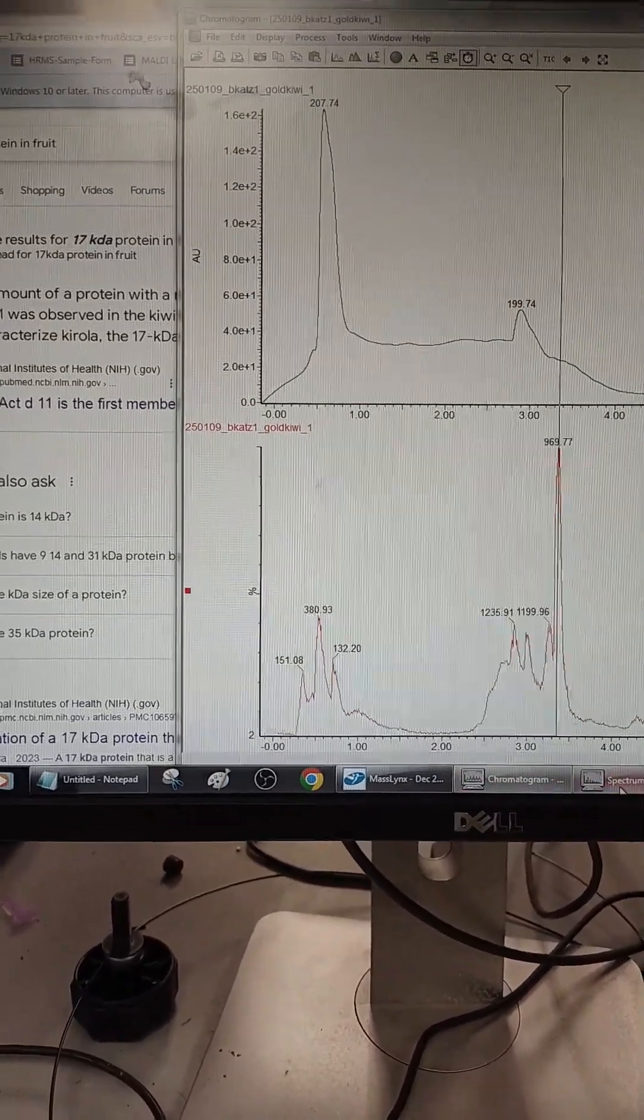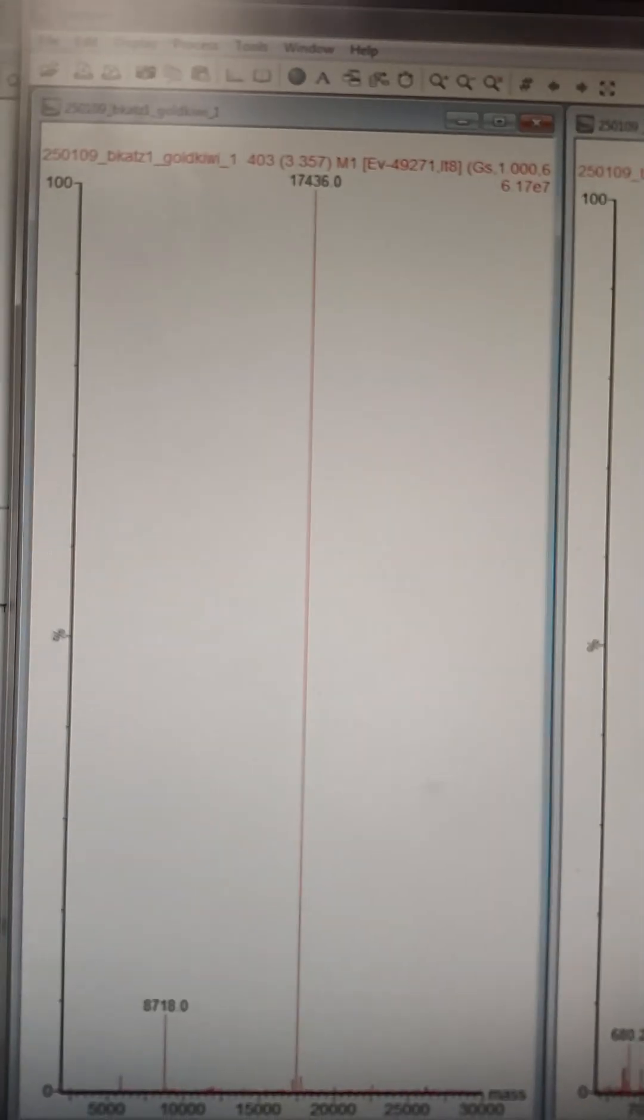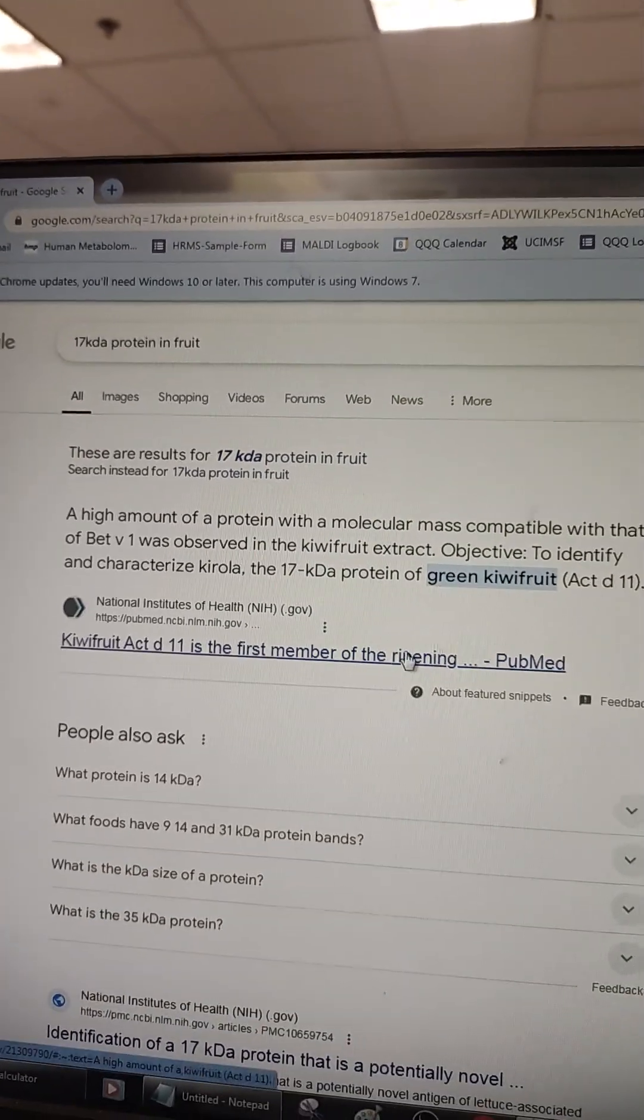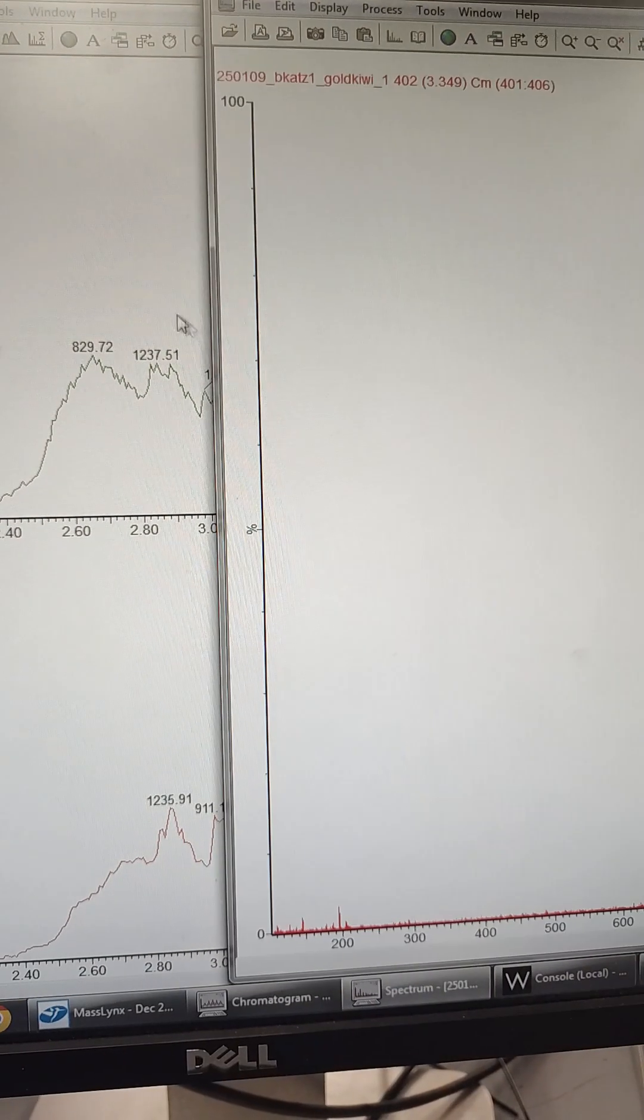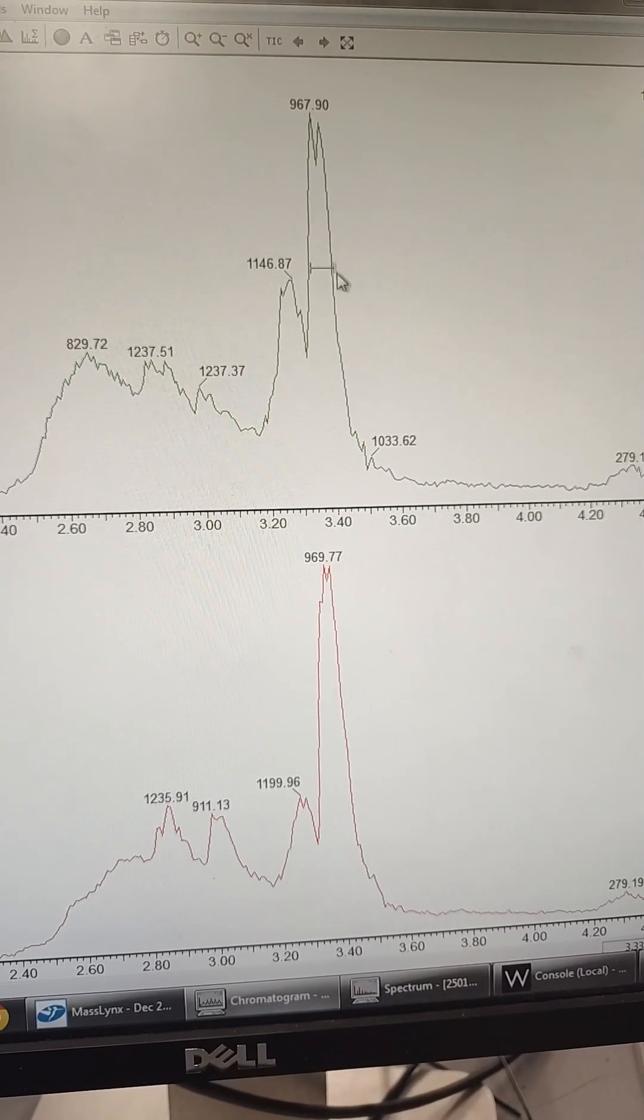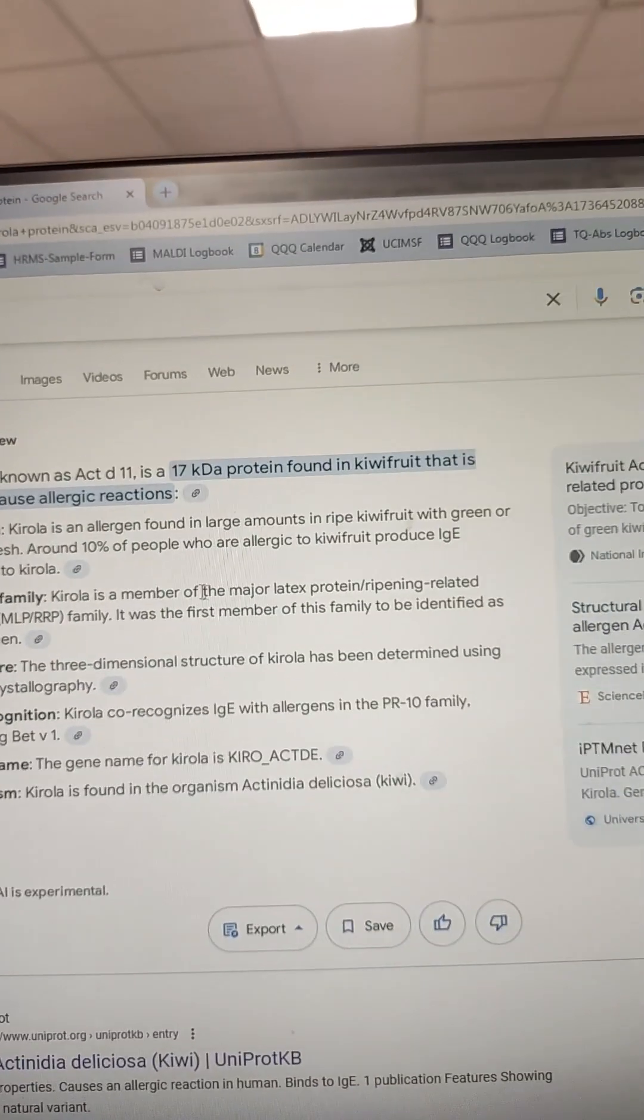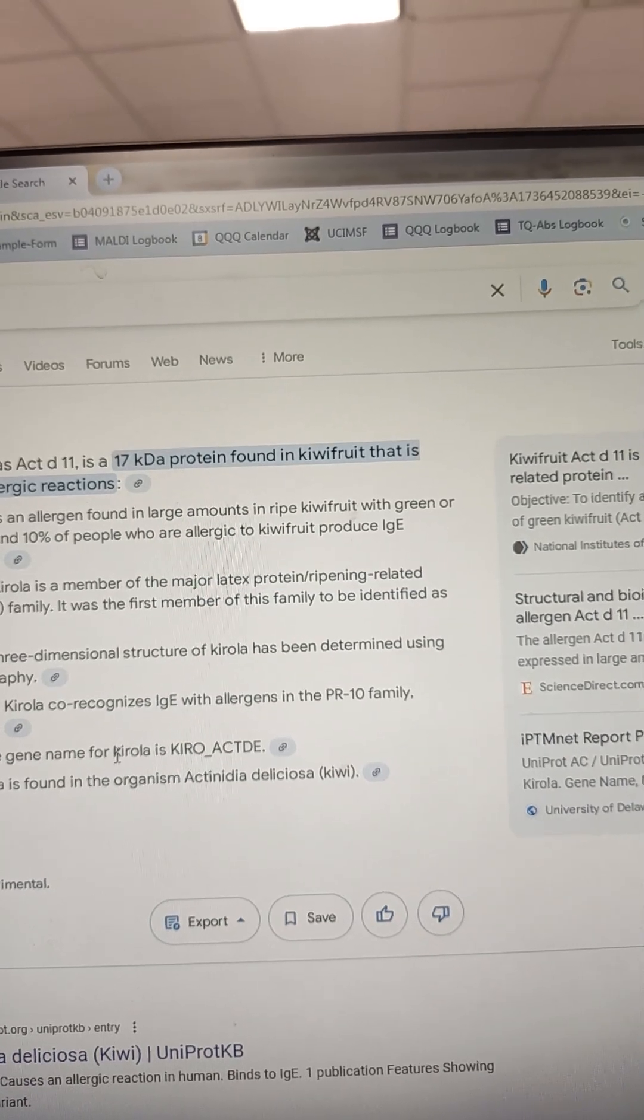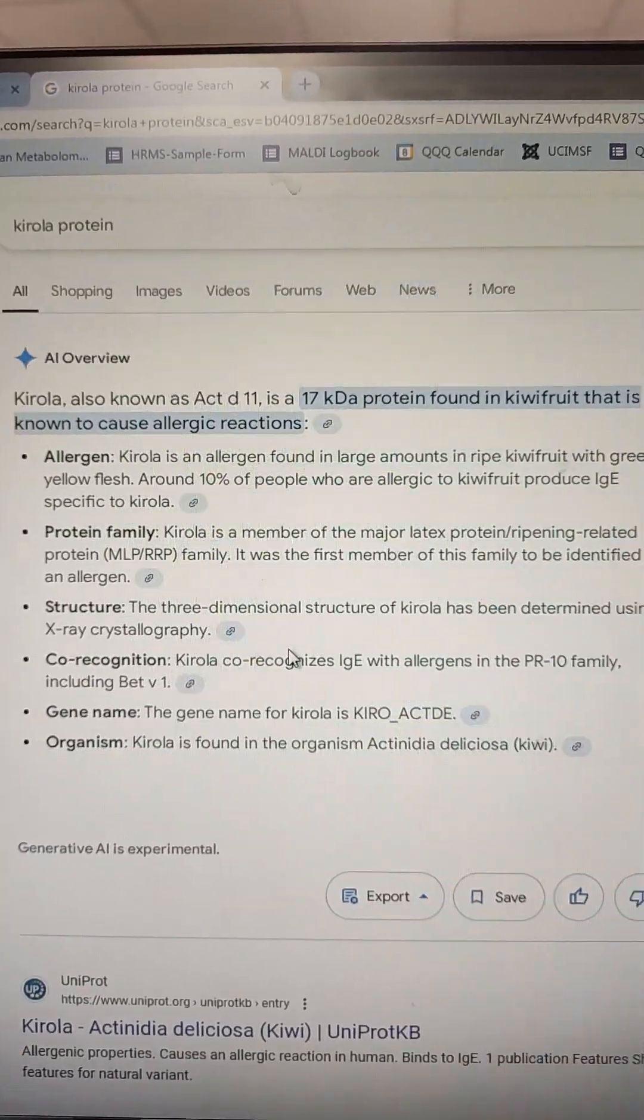I ran a kiwi and then I got a protein signal. And then I just broadly deconvolved it and got a mass at 17k. And then I searched 17k kiwi allergen protein and fruit. And the first thing that pops up is kiwi fruit. Come on. There's no way I'm that good. Is that protein charge state series of that 17k allergen protein called Kirola, which is a ripening protein. It is a major latex ripening protein.